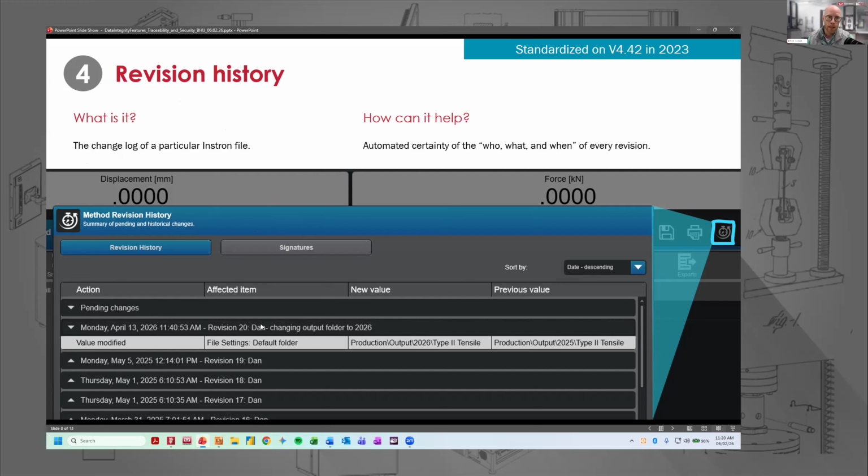But if you do make those changes, say revision 20 was made on my computer, the audit trail entry would reflect the changes for that file within the audit trail as well. So the audit trail is all-inclusive, has everything, all files, all interaction with logging in, logging out, people trying to log in with invalid credentials, different system level actions, whereas revision history is associated to each particular file.